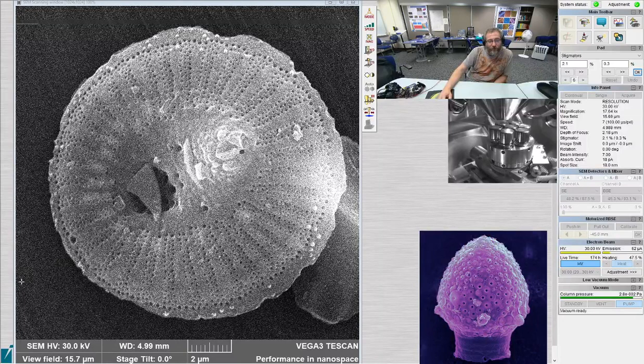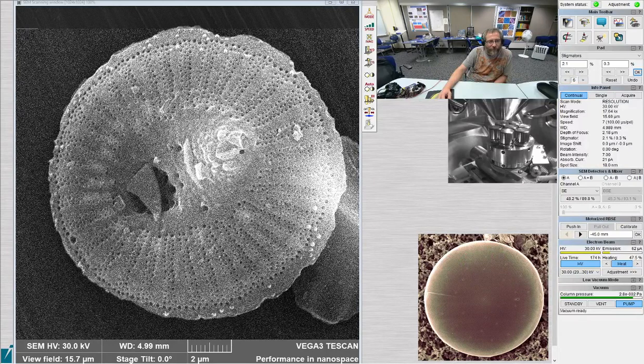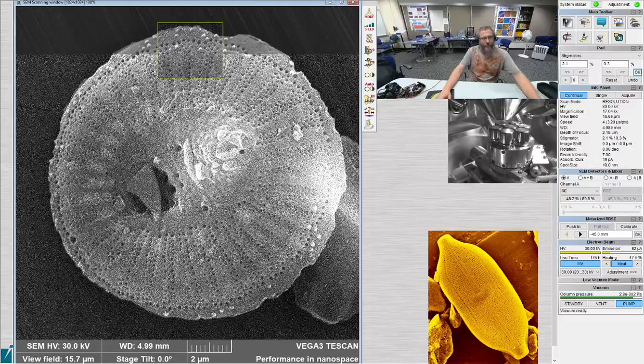I think this one is slightly football shaped as opposed to circular, and we're just looking at it tipped as well. Yeah, it's a little bit. The other straight on images we have with this one, it's slightly football shaped, like a rugby ball rather than a football.